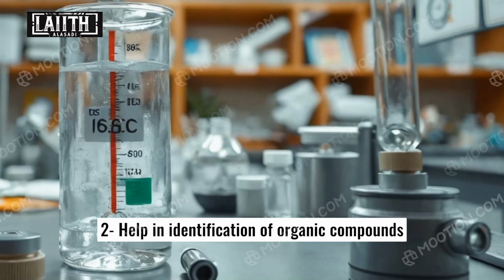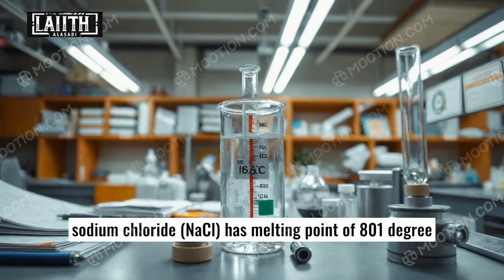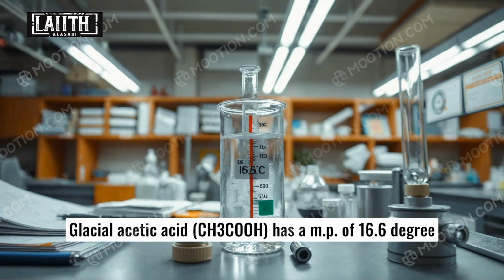2. Help in identification of organic compounds. Sodium chloride, NaCl, has a melting point of 801 degrees centigrade. Glacial acetic acid, CH3COOH, has a melting point of 16.6 degrees centigrade.